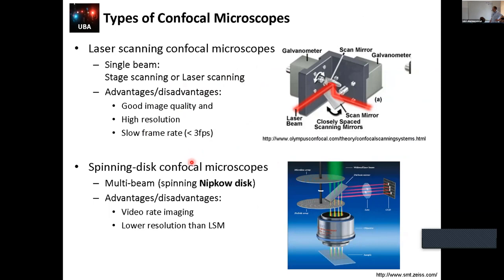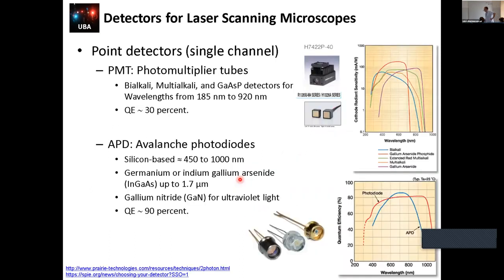But there is another confocal microscope, the spinning disc, which uses a wheel with many fixed pinholes that is moving on top of or after your objective, and using lenses, it will pass the light from different regions in space through the pinholes and will select a region of interest. This is poorer in resolution than a confocal microscope, because the pinholes are fixed. But you will read all the pixels in parallel with a camera. So you are really going to go really fast, because in the scanner we can detect a point on a microsecond time scale, and here we can go maybe to the millisecond time scale, but with a million pixels in parallel.